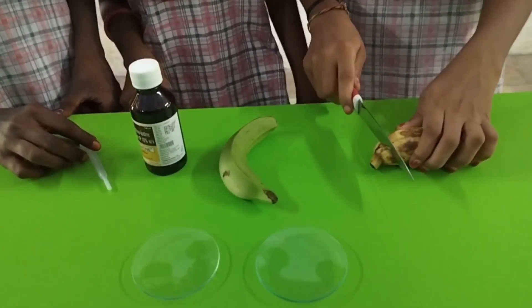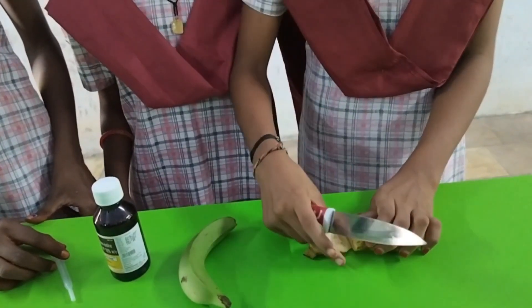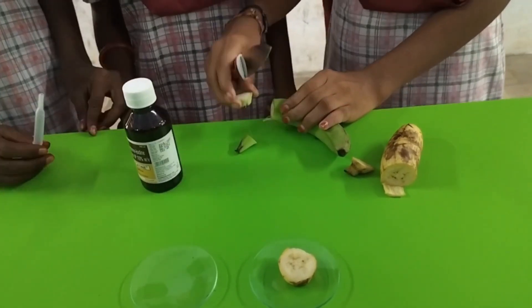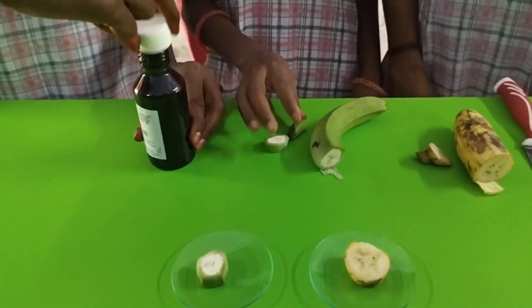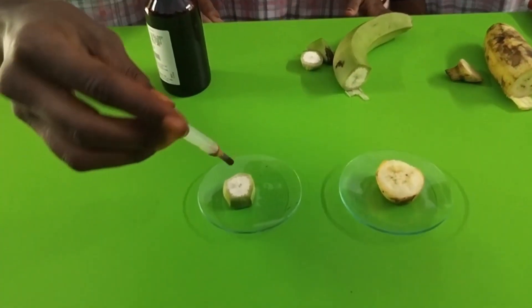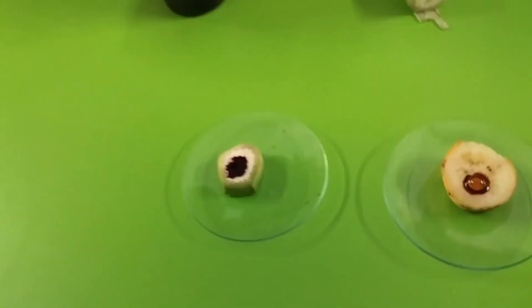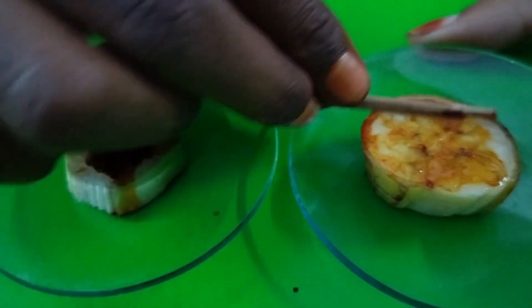Take the slice of ripe banana and keep it in a watch glass. Take the slice of the unripe or raw banana and keep it in another watch glass. Now add a drop of iodine over the banana slices. The color of the iodine solution is brown or yellowish orange. Spread the iodine solution over the slice uniformly.